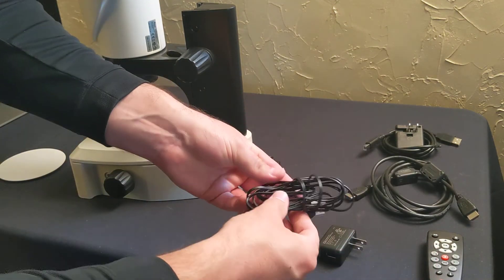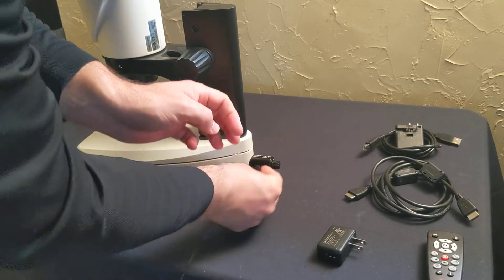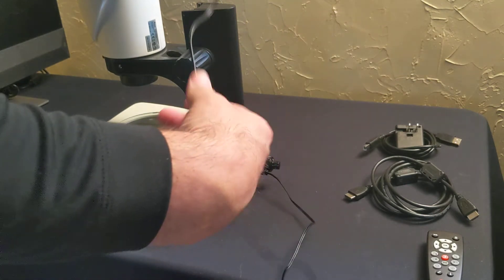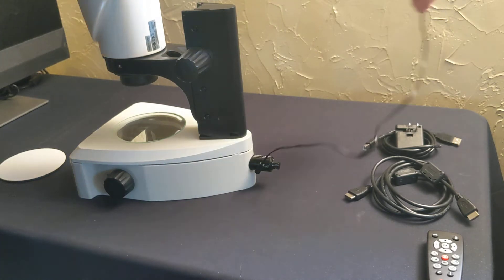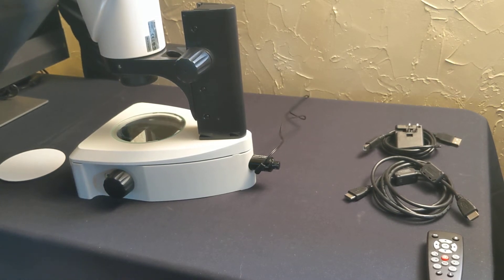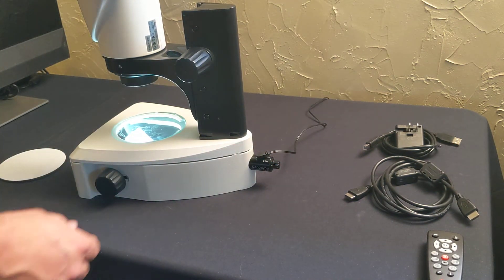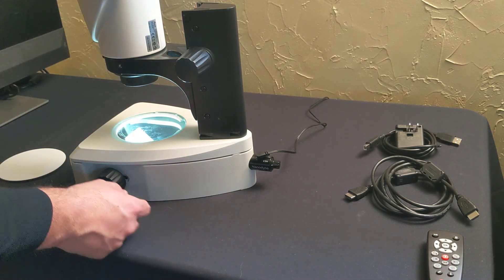We've got our power supply — put that into the USB, plug it into the wall, and that's your light source. So now we have light. For the connections to the camera itself, we'll go through that next.